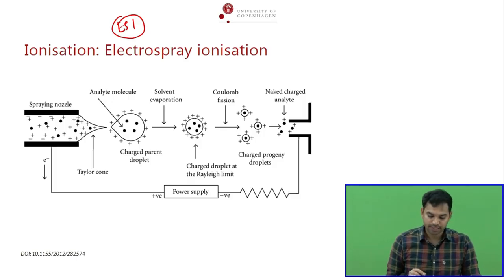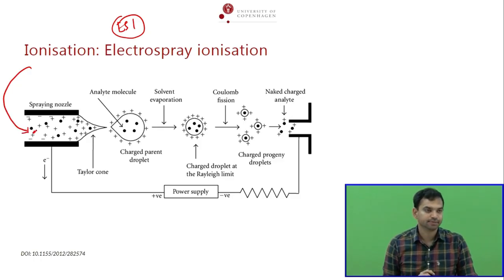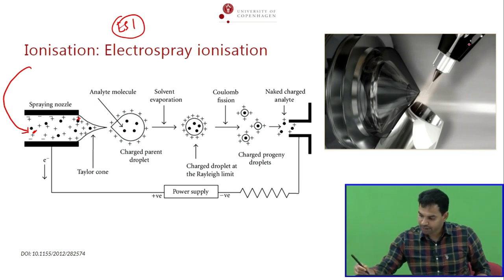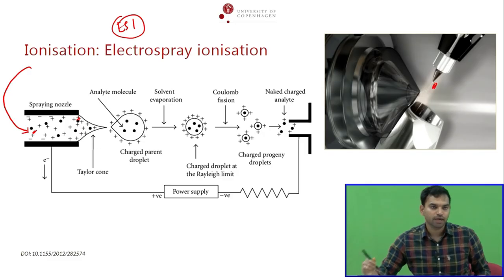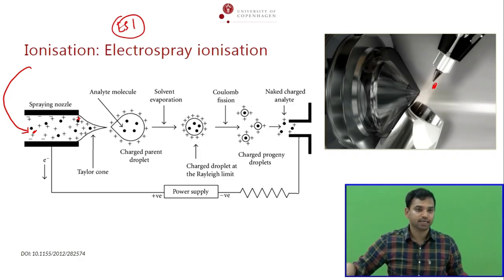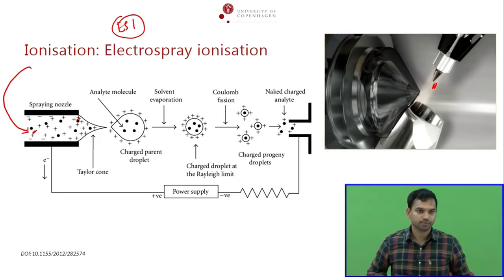So what we do here is that the analyte is coming again from the column. This is my analyte, okay? And the solvent will have this solvent charge and so on. Basically, we spray the analyte in a small nozzle. You know the scent bottle? You spray, it becomes an aerosol. Exactly that thing we do here. Okay, with some gas, we spray the analyte, it becomes an aerosol, right?